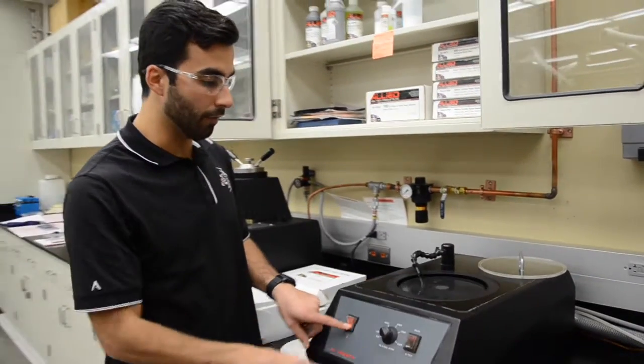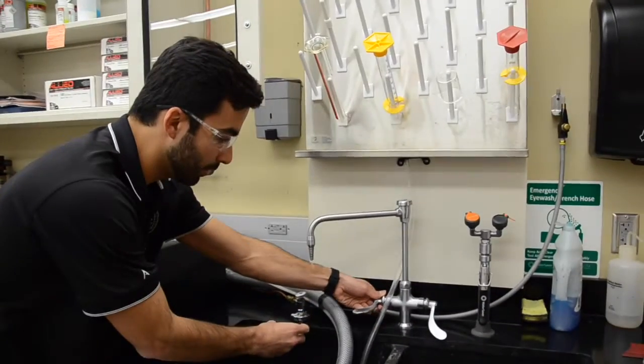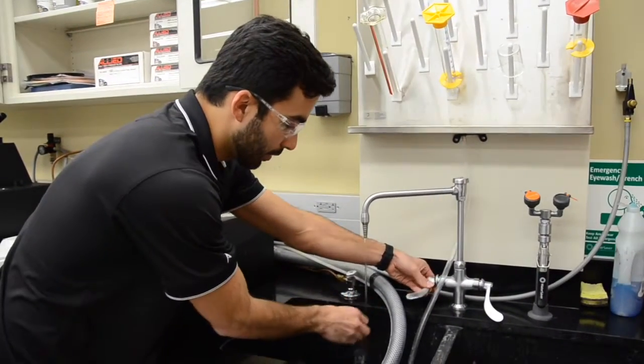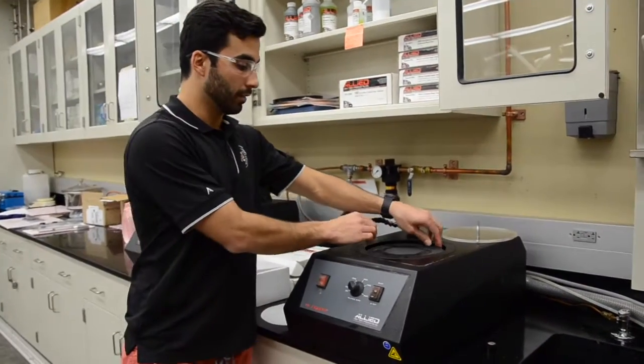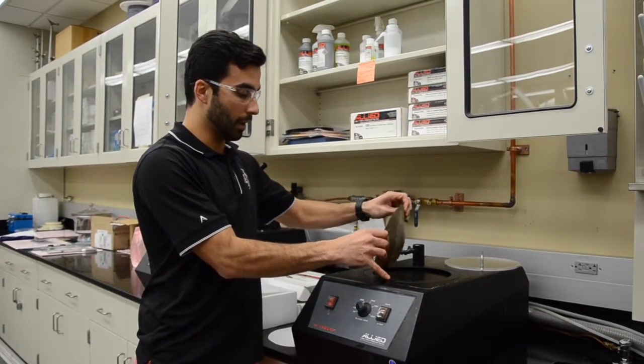As you can see here, once you finish the step, you turn off the machine. You come here and you want to rinse it with water to clean from that step and move to the next step. And then you peel off the sandpaper and get the next one.